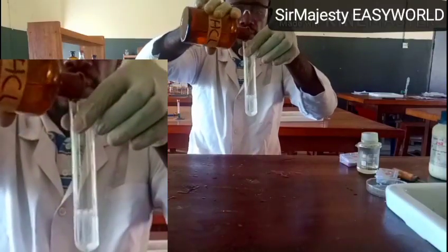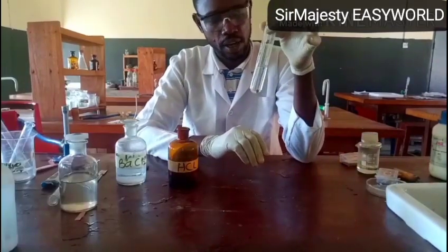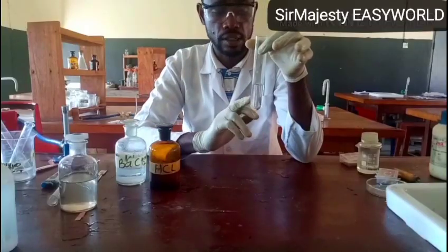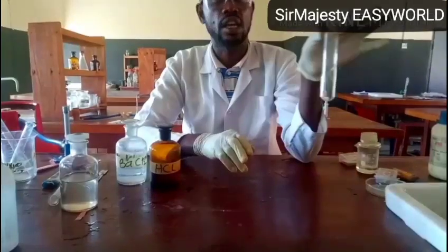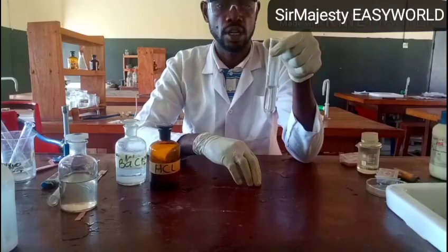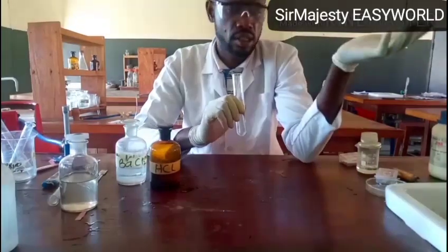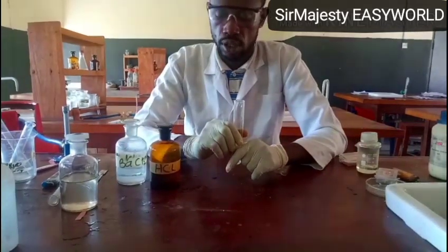Okay, you see that's what we call effervescence. So in your observation, what do you observe here? There is effervescence, a colorless, odorless gas evolved. Normally, since we know this is ammonium carbonate, the gas that evolved here will turn lime water milky and the precipitate dissolved. So you can see the solution is clear. We are no longer looking at SO4. It means that what we have here is CO3 2 minus. If it is SO3 2 minus, it will release a gas that has the smell of burning matches. But this one, on wafting, is odorless, and that shows that what we have here is carbonate.